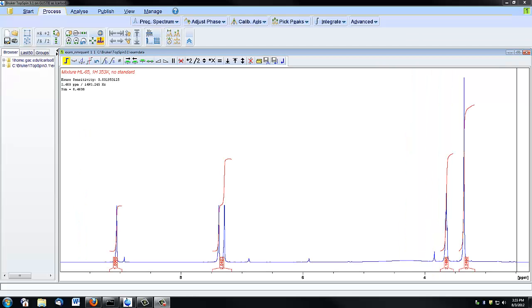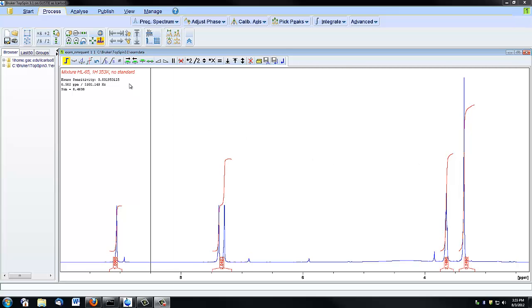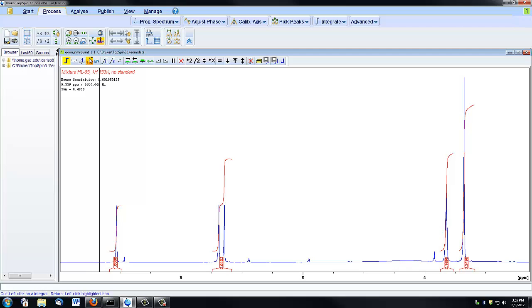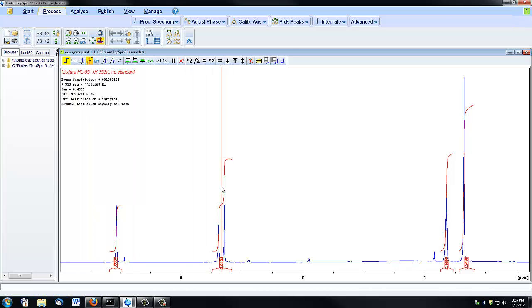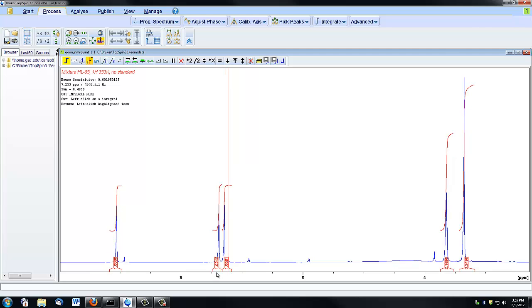If I later decide that I want to split one of my integrated regions into two, I can select this Cut Integral icon here, and then use the red cursor to designate where I'd like the integral split. Now I have two values here where there used to be one.